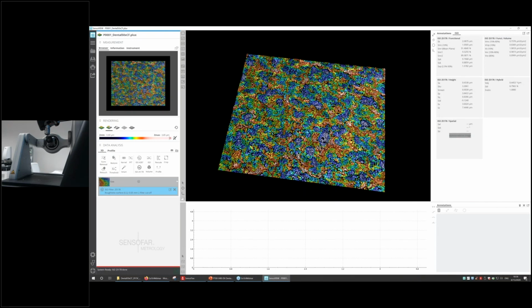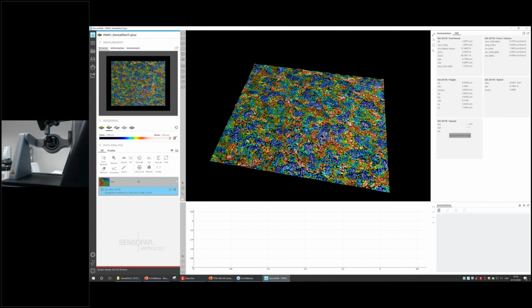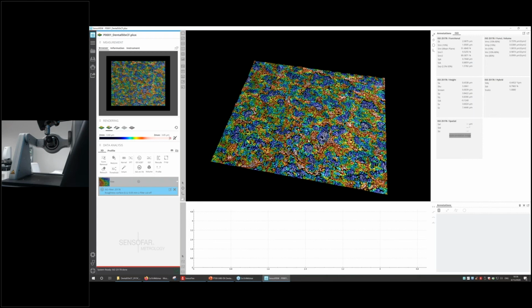And this is a real roughness topography. Now if we look into the Sa, we can see that it has dropped down to 0.65 microns. So I would believe much more in this topography than the previous one, which included other frequencies that are not inherent to the roughness.